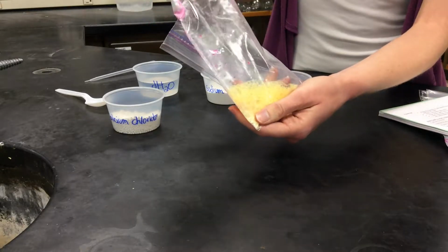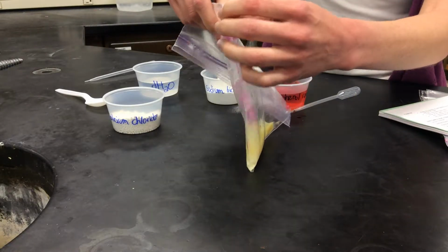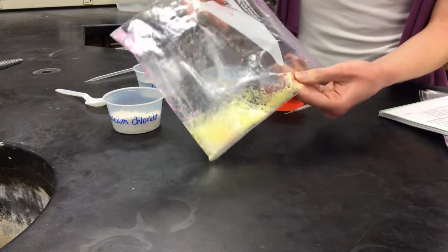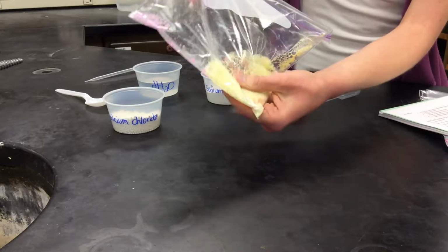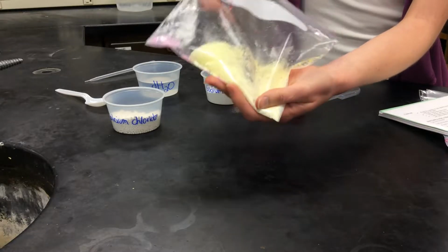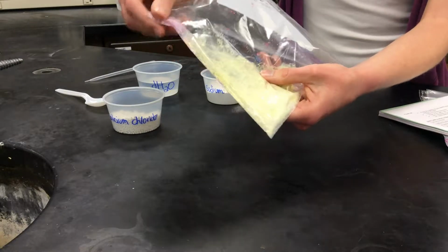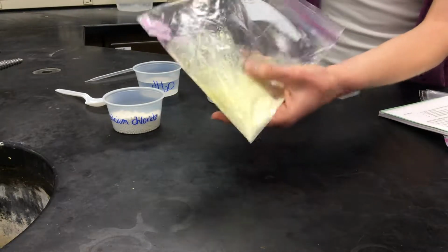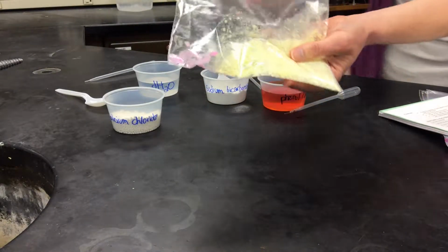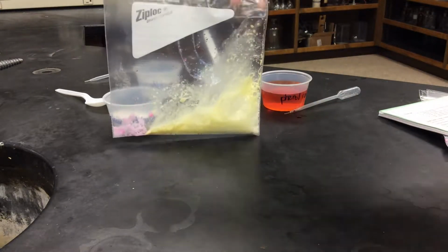You can see down here we've got a nice chemical reaction going. Okay, there's some fizzing going on. Obviously you can see a very drastic color change. And if you could feel this bag, it would feel very warm. Okay, so it's warm. So that's one of the observations you want to write down. It's warm, it's fizzing, and it's yellow. Okay, there's a color change. So you can see that there's air being created, the bag's kind of expanding. I'm going to walk over here so I can make sure you can see.